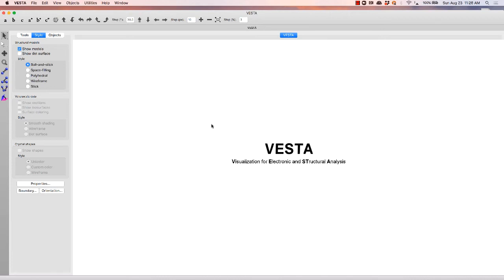Alright folks, if you're here, I'm assuming you were able to download Vesta successfully and get it installed, and now you're looking at it going, what the heck do I do with this piece of software?